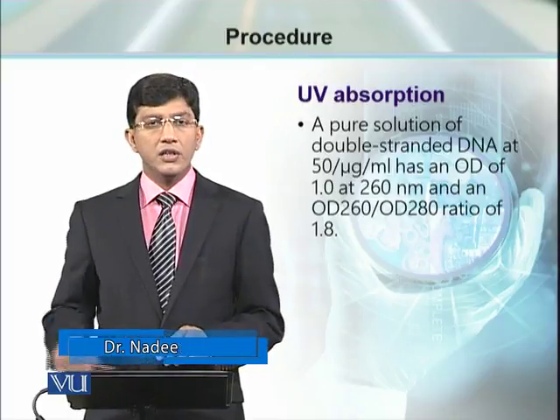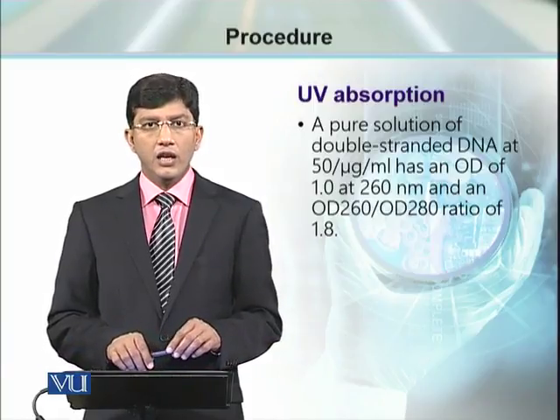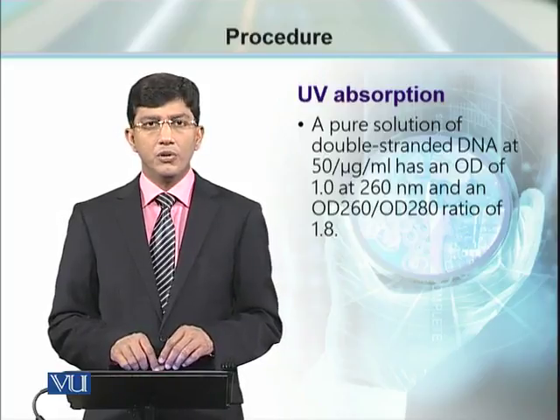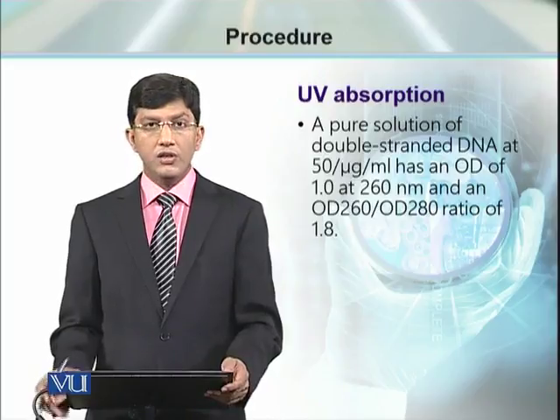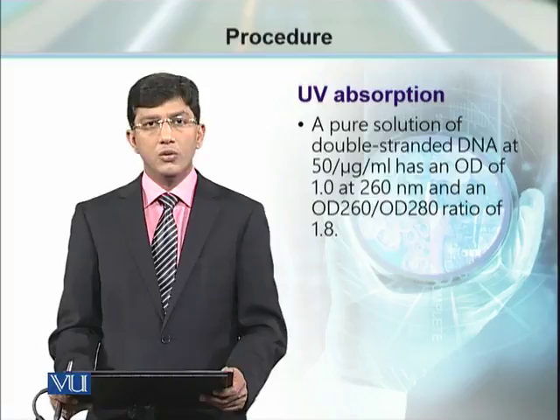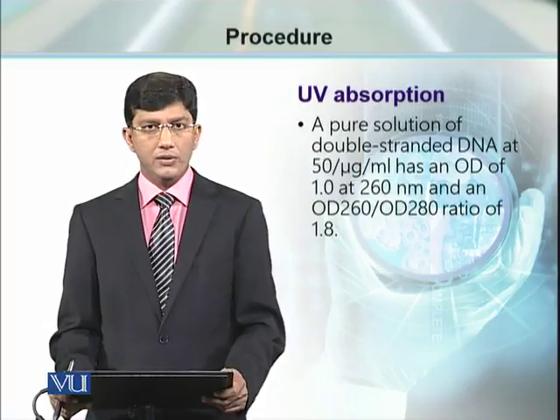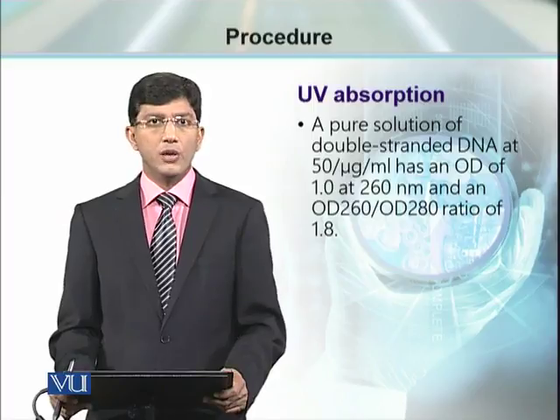इसके साथ साथ क्वांटिटी के साथ साथ हमें जो चीज़ देखनी है या जिसका ख्याल रखना है, हाउ प्योर इज़ द सैंपल. इसमें किसी किस्म की इम्प्योरिटी, किसी किस्म की कंटेमिनेशन तो नहीं है. कंटेमिनेशन और इम्प्योरिटी कैन बी डिटरमिन्ड बाय ऑब्जर्विंग OD रेशो और एब्जॉर्बेंस रेशो at 260 wavelength and 280 wavelength. For a pure double-stranded DNA sample, this ratio is 1.8.